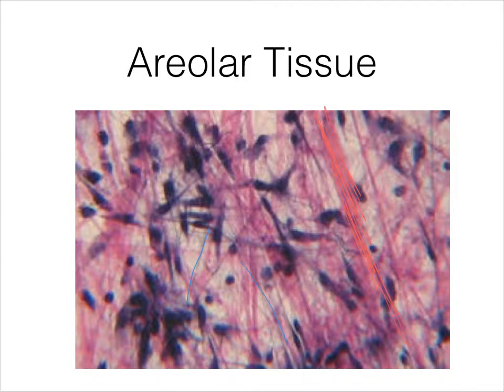And you have a medium to medium-dense dispersal of cells, mostly fibroblasts, but you still have open areas here, here, here, which are areas that cells can use to move in and out.